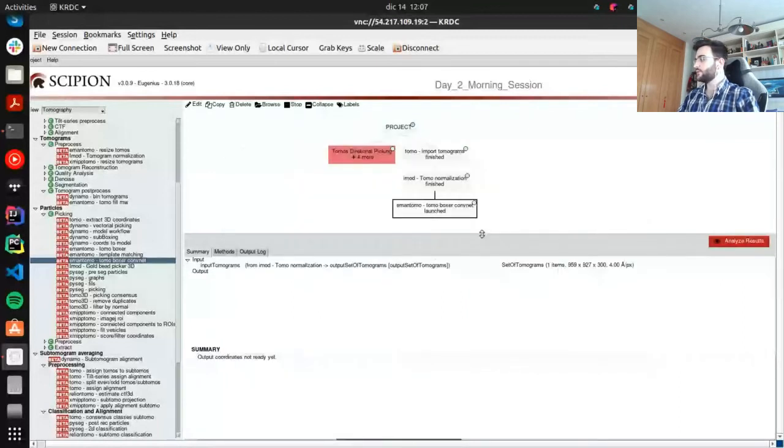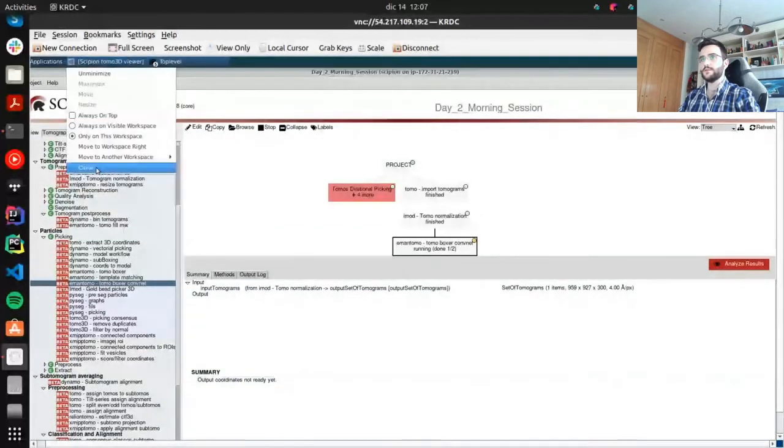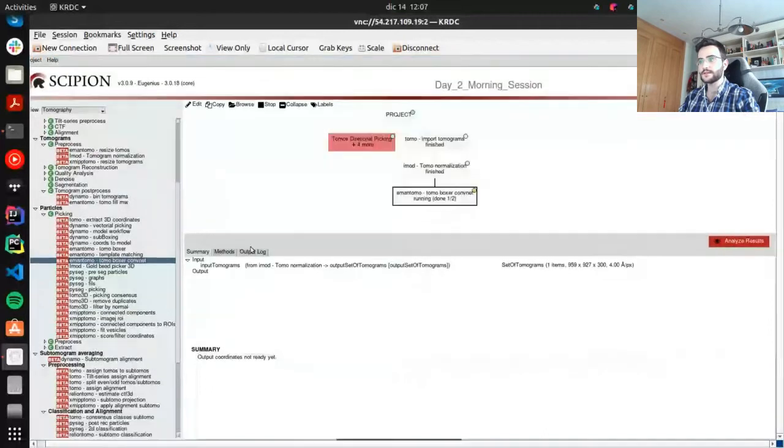This program won't pop up the tomogram dialog that appears in Dynamo. It will directly open the interface of Eman, because Eman already provides a window to select tomograms in the set. That way the protocol is simplified. Okay, I'm going to close this window. I'm not sure if it already appeared. It doesn't seem like it, so let's wait a little bit.